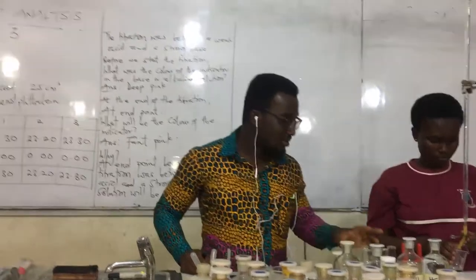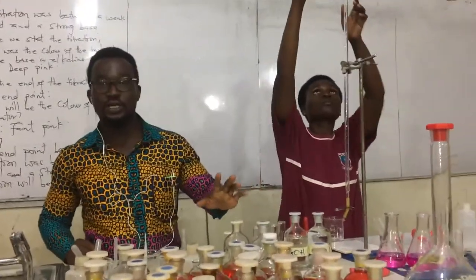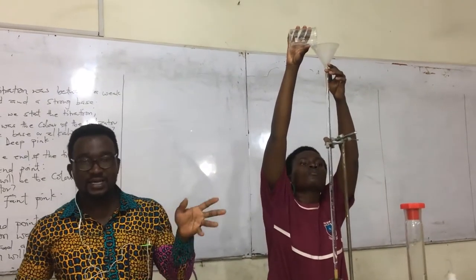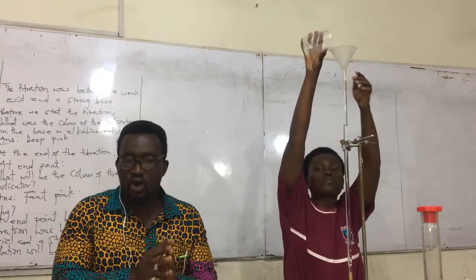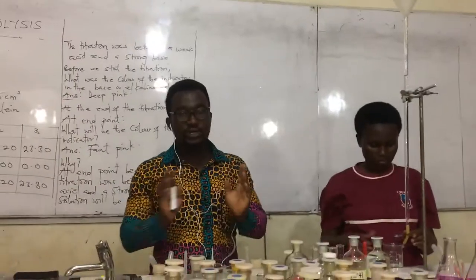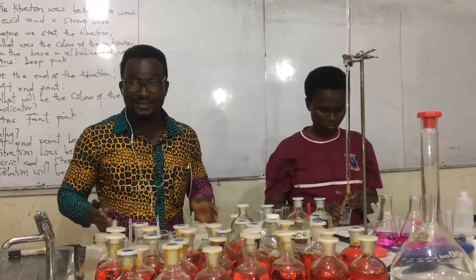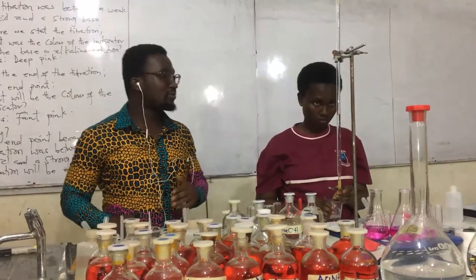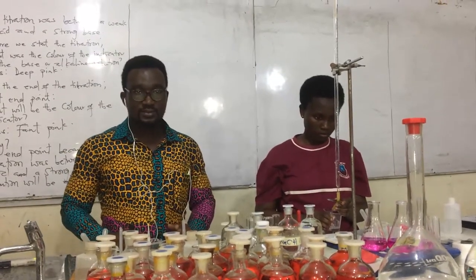So what you need to do is to rinse with the deionized water. And then later we rinse with solution A. I told you from our first titration that it is only the conical flask we don't rinse with solution B, or any other solution. It is only the deionized water we use to rinse the conical flask, and then tap water, that's all. Then you are set to go. So she's rinsing. It's not easy.